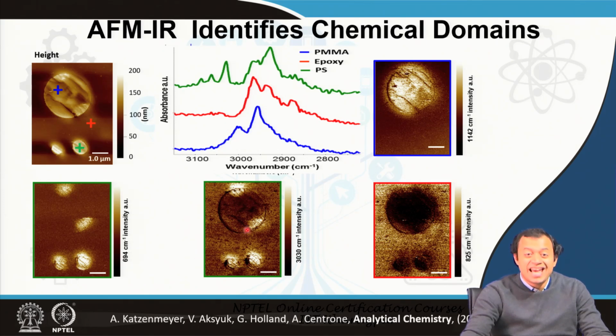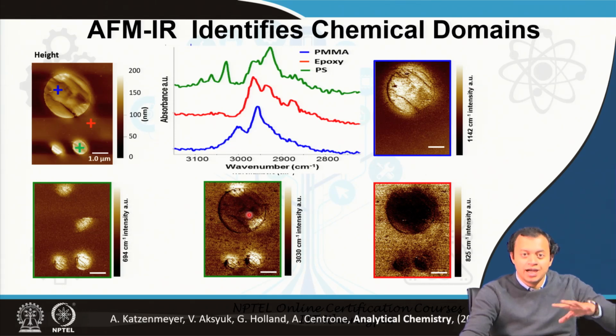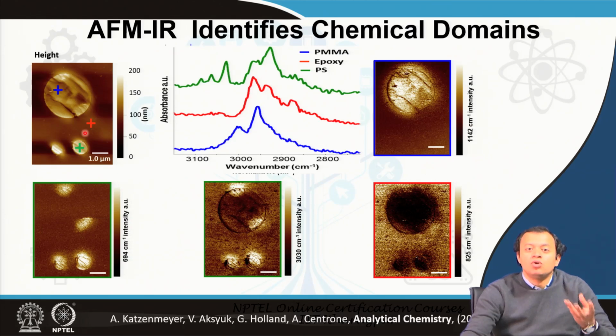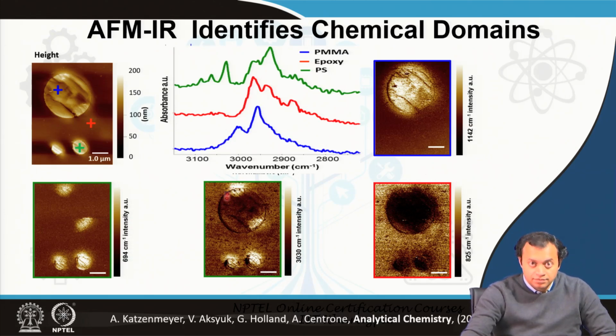Will you not consider this as an X-ray at nanoscale? There were actually 2 polystyrene spheres hidden beneath this big sphere, which has completely concealed them. As a result, the height image or the microscope image, even a proper confocal super resolution microscope image, is still unable to resolve it, but these gentlemen have been able to. I am incredibly grateful for their help and guidance, and we are able to see this.